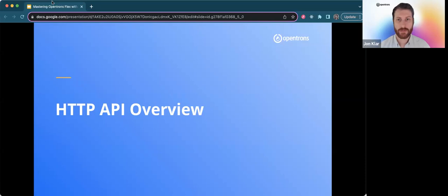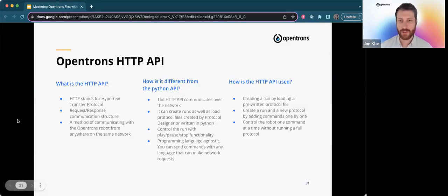Alright, thanks, Nick. For everyone that has questions for Nick, we'll go over all of them at the end. But for now, I'm going to talk a little bit about the HTTP API. What is it? Why would you use it? How would you use it? So what is the HTTP API?